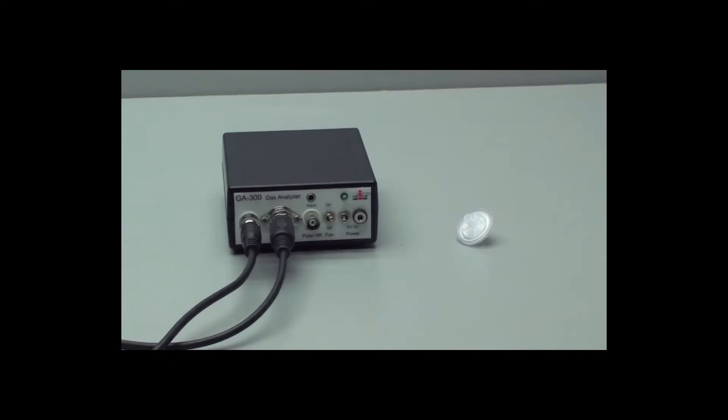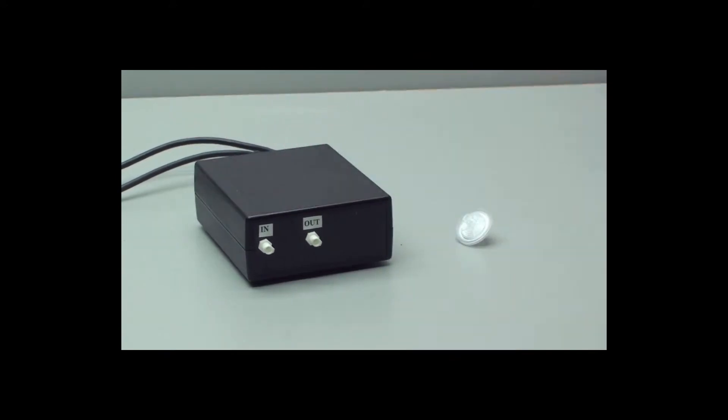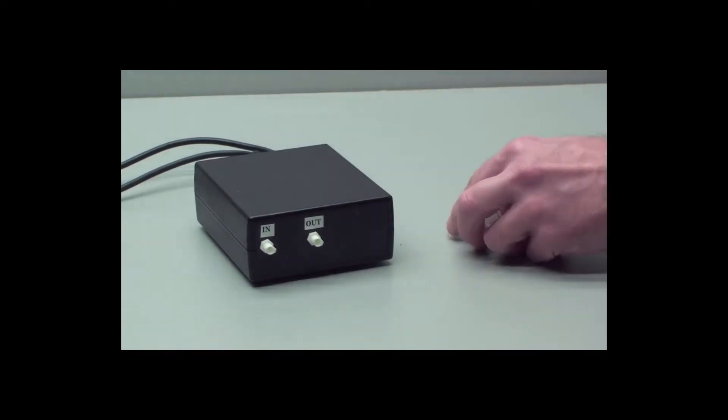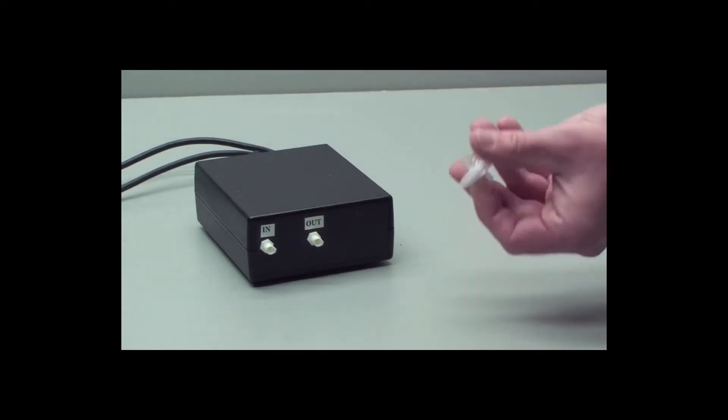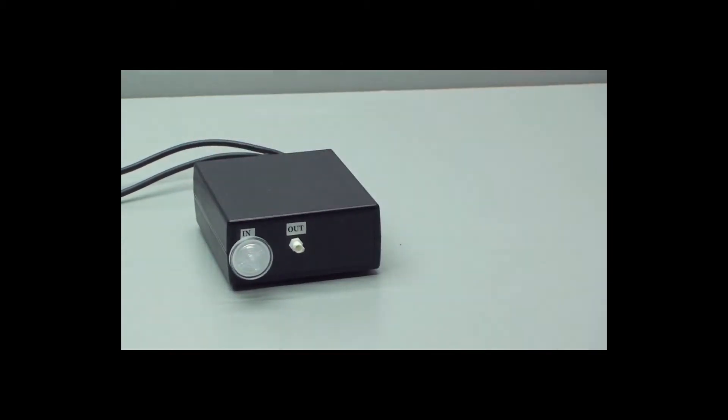Go to the back side of the gas analyzer. For the filter, take the lure end and that goes into the inlet of the gas analyzer. Don't over-tighten, snugly is fine.